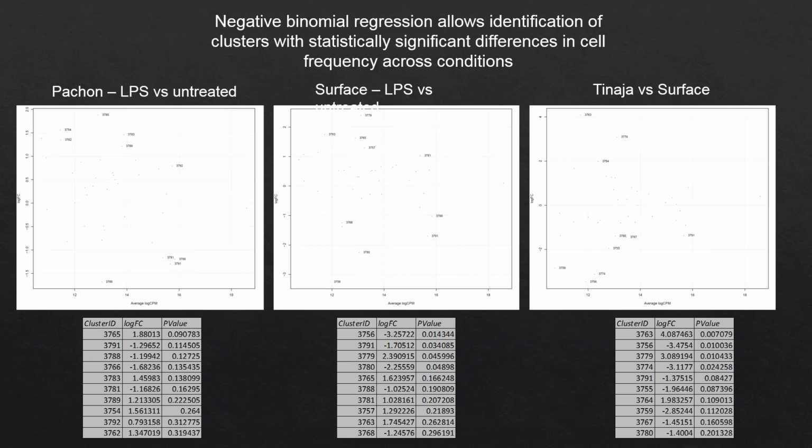Okay, and I should just say at this point, because I don't think I show it, that what you can then do, of course, is go to FCS Express and say, all right, now let me look at these clusters, set up some figures, have a look at what these morphologies look like, and lay out some nice panels like that, and then build that into your biology workflow and hypothesis building.